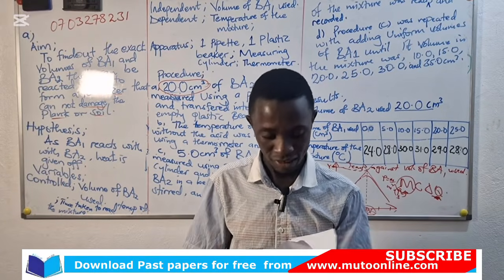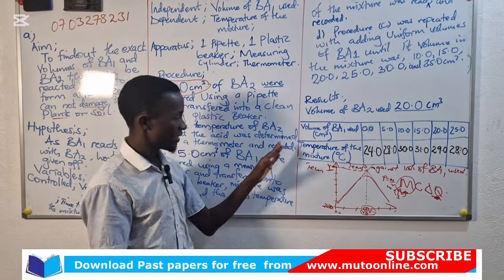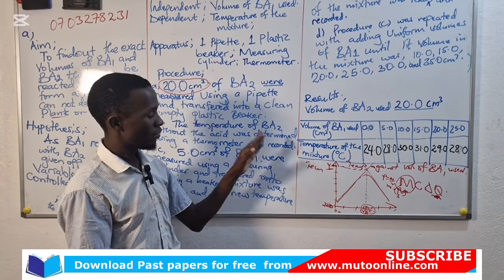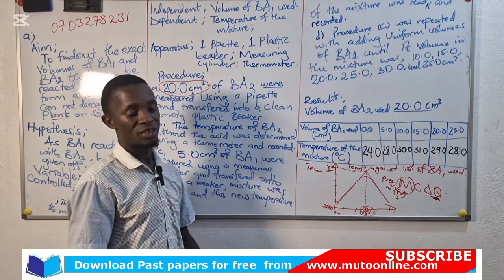Don't forget, members, we are determining the maximum volume or the exact volumes with these kinds of procedures.